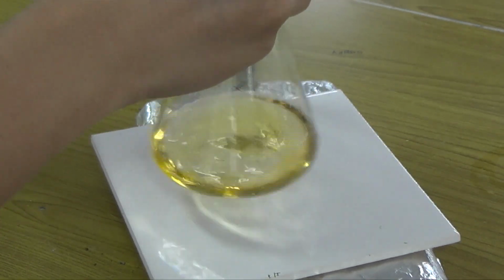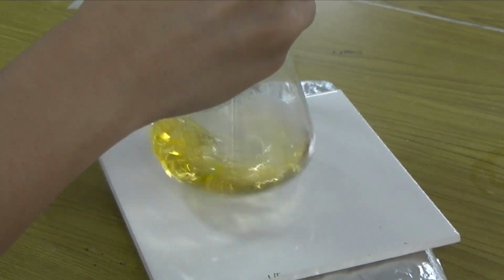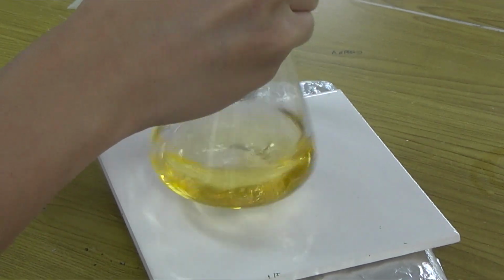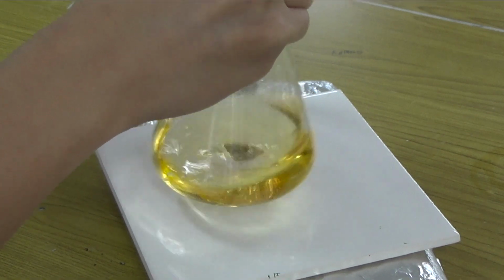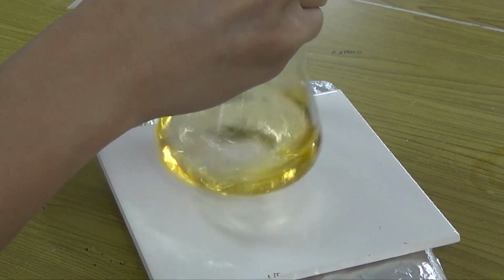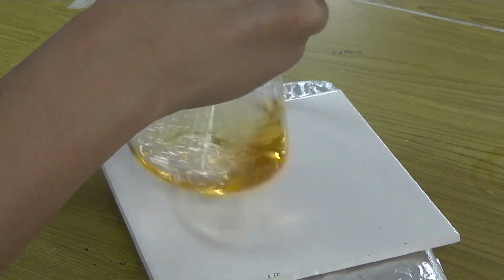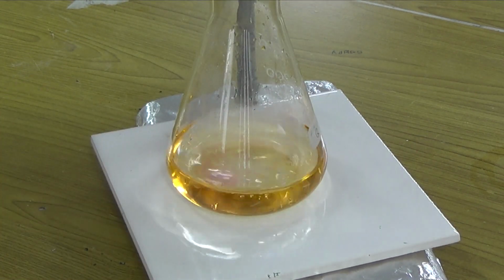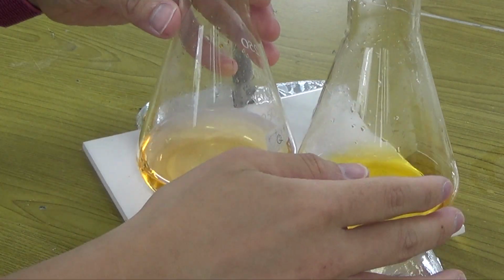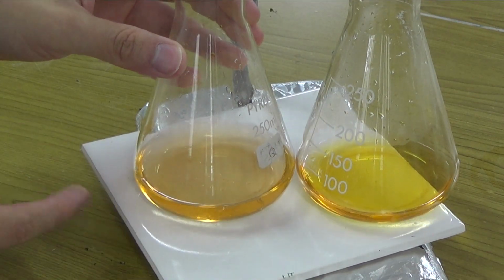Hopefully you should see the color change. So this is the slow bit. You rush the other bit, and you don't waste too much time doing 1000 titrations. You do one rough, and then you try to be exact from the second one onward. Your hand is always on the tap here because once the color changes to orange, then you stop. At the moment it is still yellow, and I think it has just turned orange actually. So this is yellow before any acid. There is orange at the end point.